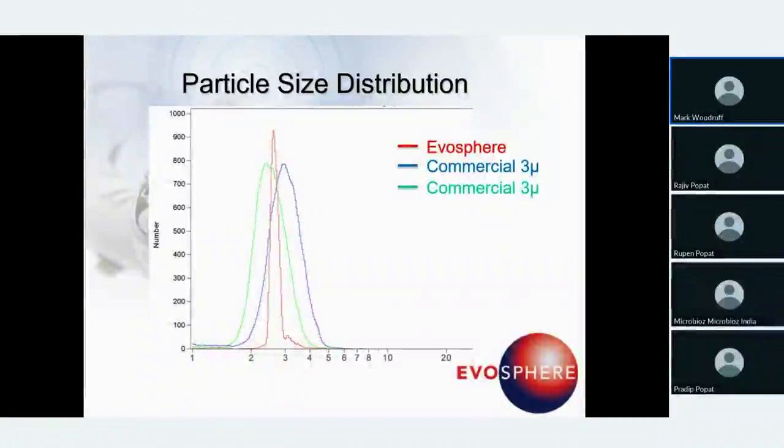You also have 3.5, even up to 4 micron particles in these columns. So that gives us the level of efficiency that we've always had. But can we improve that? Because if we can improve the efficiency of the column, then you saw from the resolution equation that increasing efficiency gave us more resolution, more selectivity between our compounds.